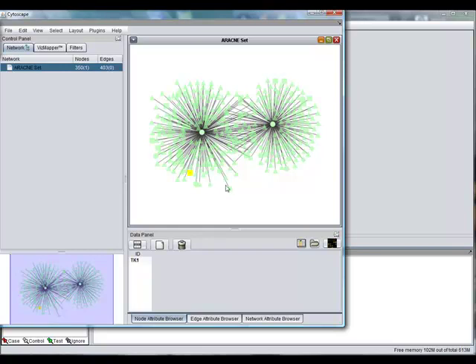The lines that link between a pair of nodes, called edges, indicate the correlated gene pairs. As shown in the upper left panel, there were 350 genes and 403 correlations that have been identified through this ARACNe run.